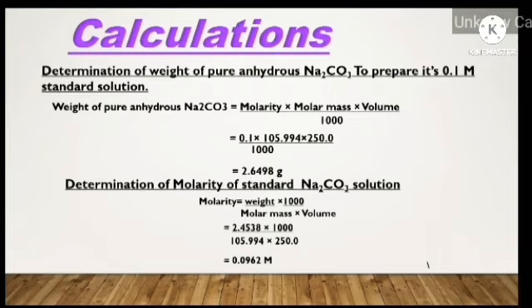Putting in the values, we get 2.6498 gram. For the calculation of molarity of standard sodium carbonate, apply the formula weight multiplied by 1000 divided by molar mass multiplied by volume, and we get 0.0962 molar concentration.